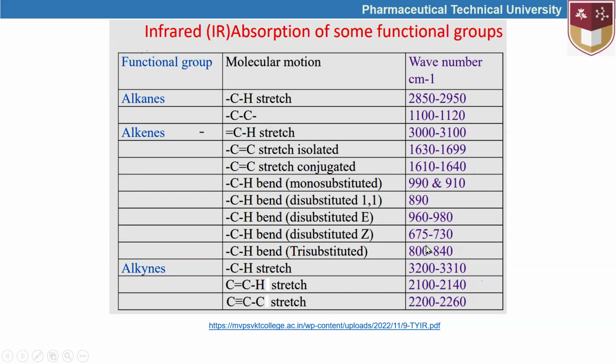They also differ from each other by the location of some functional groups. You can find out on the net. I want you to understand another point, that this monosubstituted is quite highly differing from the disubstituted ones.